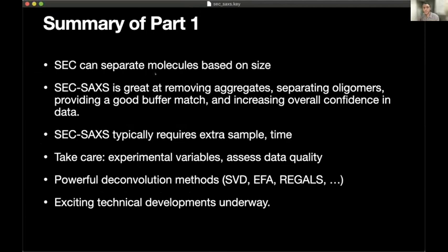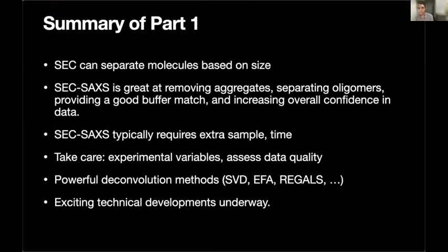Okay, so I'm just going to briefly summarize what I've told you so far before we move on to REGALS. SEC is really great. It can separate molecules based on size, and it removes aggregates, separates oligomers, provides a good buffer match, and it just increases your overall confidence in your SAXS data, which is important.